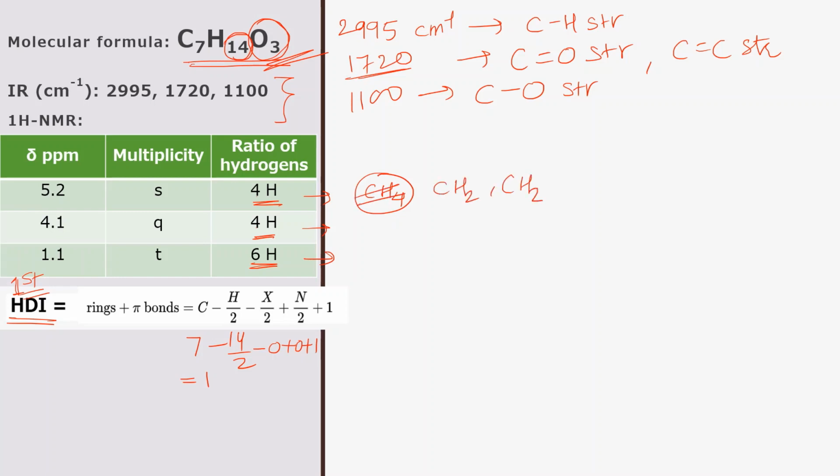Maybe they are chemically equivalent but at different places. But yes, since their neighborhood is same, so only they are giving the single peak, means they are chemically equivalent. Then again next we have is 4H, that is again CH2, CH2. So these are giving quartet. See, these CH2s, the earlier CH2s, they are giving singlet, means on the adjacent carbon of these CH2s there is no hydrogen.